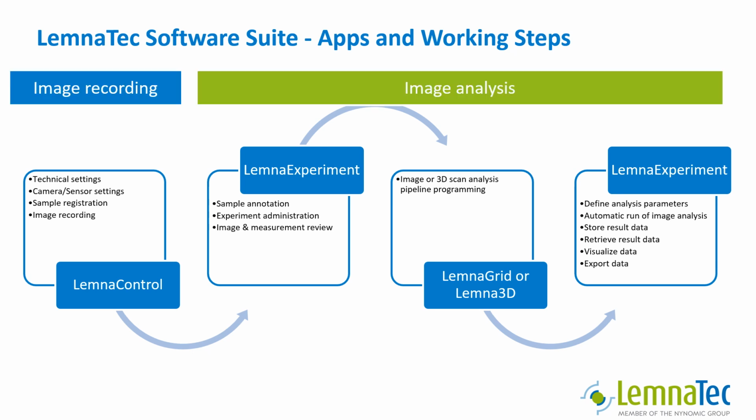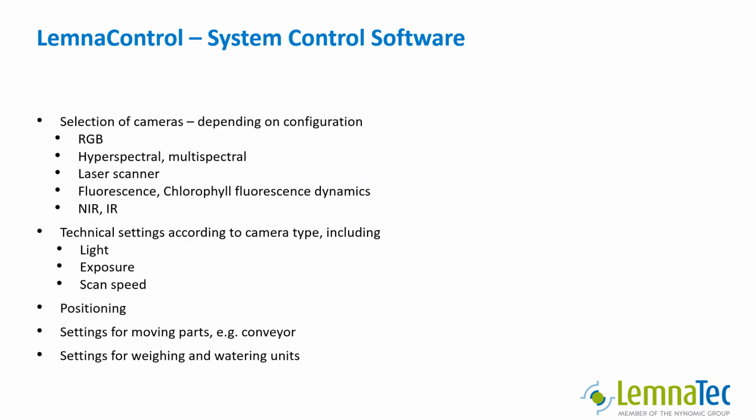Here we focus on image recording, so on the usage of LemnaControl. The analysis and the related apps are part of a different training. The system control software, LemnaControl, has several functions. The first function is the selection of cameras. This depends on the configuration of the phenotyping system.